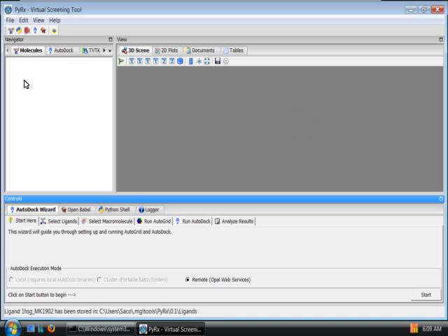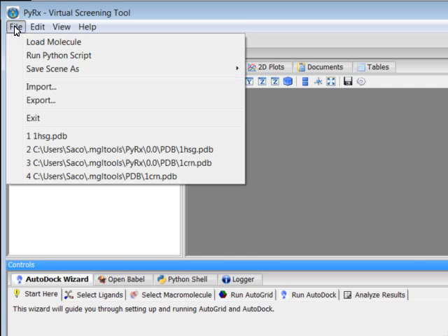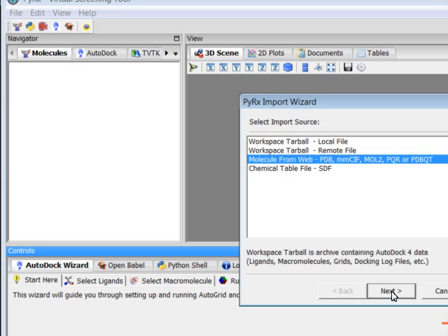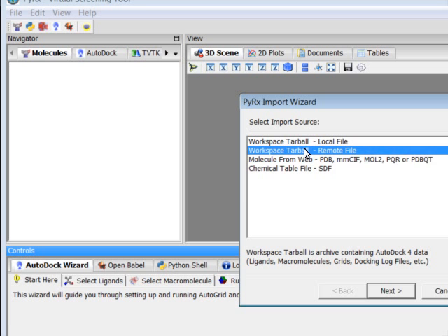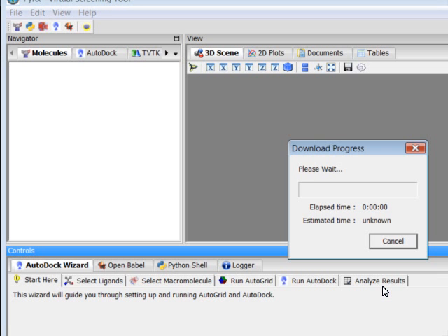For the next part of this tutorial I'll need to import sample data set from the web, so I'll go to File, Import, select Workspace Tarball, Remote File, click Next, click Finish to start downloading this data.